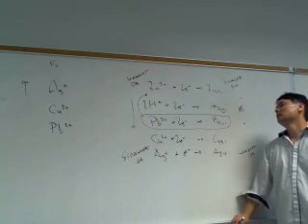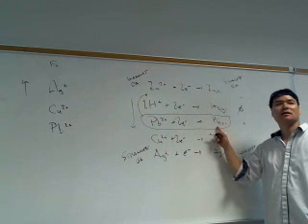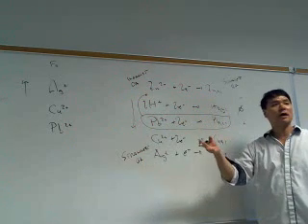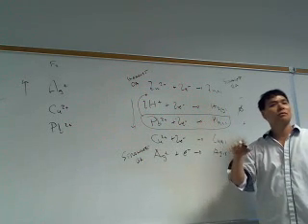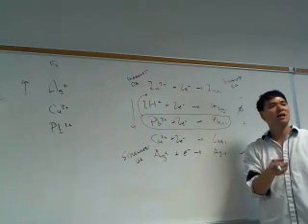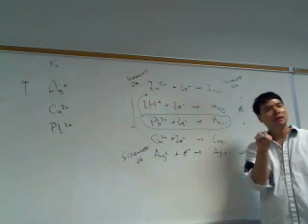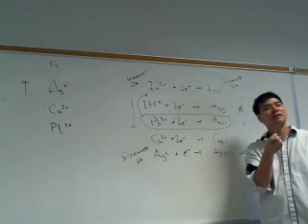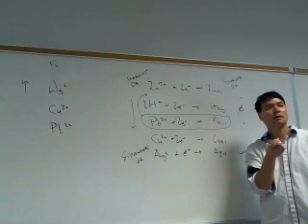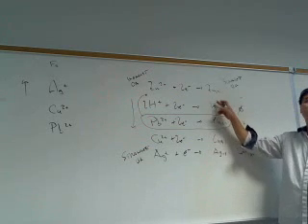Yeah, that's correct. It turns out that H plus can oxidize lead to form Pb2 plus. But the Pb2 plus that forms reacts with the chloride that's present, and you get a second metathesis reaction, precipitating lead 2 chloride on the surface of your lead metal. And so your lead metal should have gone from a dark black color to a white color. You have to give it enough time. I said give these reactions time because some of them take time. But the lead isn't going to disappear. And so this one's out of place. That's why.